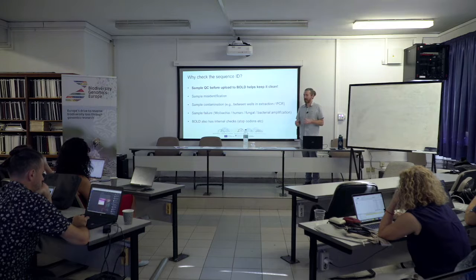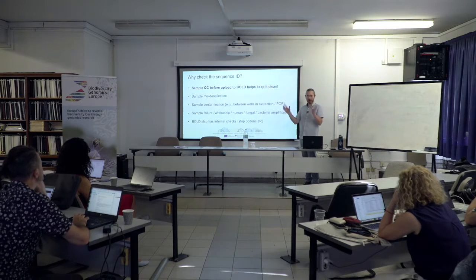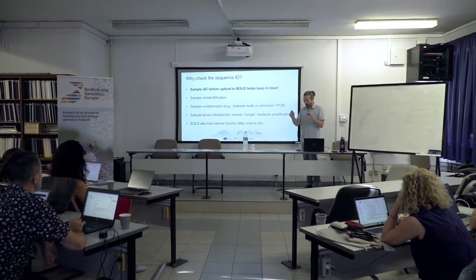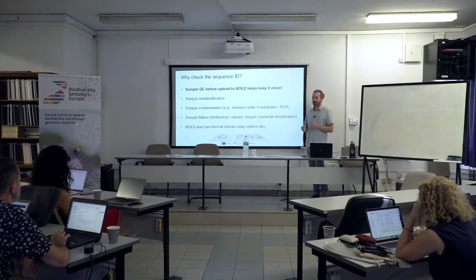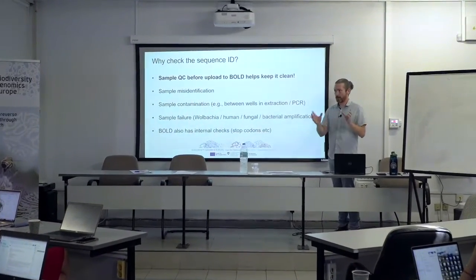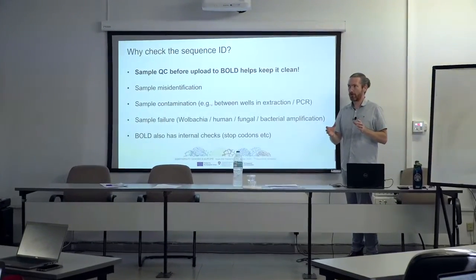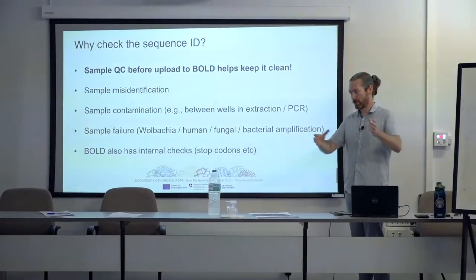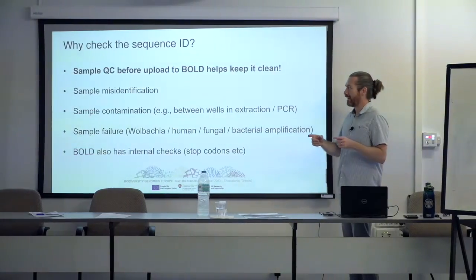It is a workbench. It has millions of records of varied quality of identification, of varied level of identifications, but all of us in the meta-barcoding world kind of just throw that out of our heads and just go, oh, wow, look, it matched that. That's great. Move on, publish that species. So we're, as part of the BGE project, going to do a lot of reference library curation around Bold, and I'll talk about that in BOLD version 3 a little bit later.